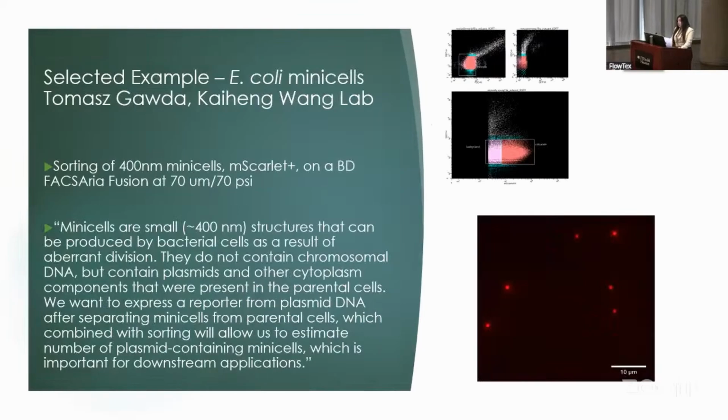So this was a proof of concept pilot sort for a graduate student developing their project. Work with minicells is often in the context of delivery of therapeutics and synthetic biology. So I knew we'd be able to see the sort on Tamaja's sample on the Fusion. I was able to characterize and test the instrument to sort down to 100 nanometers reliably. And so we sorted about 400,000 minicells for validation by microscopy.